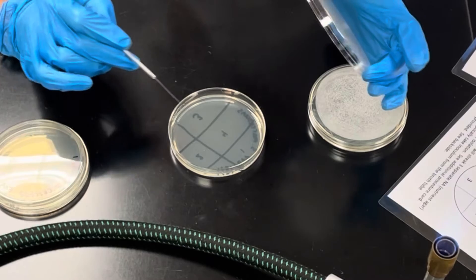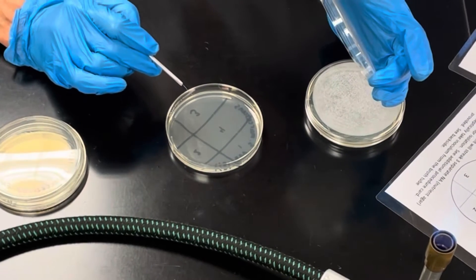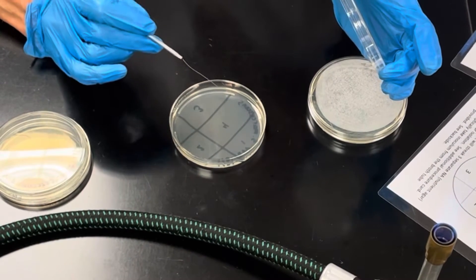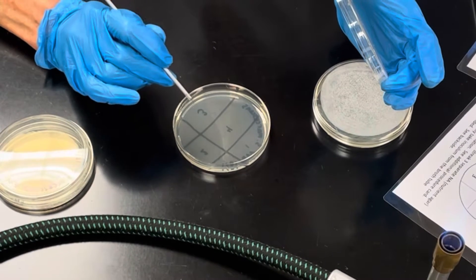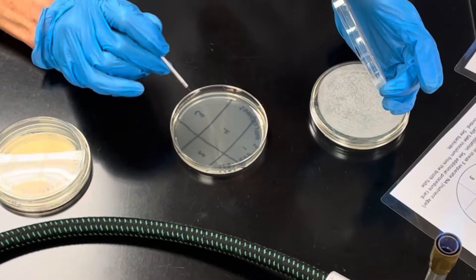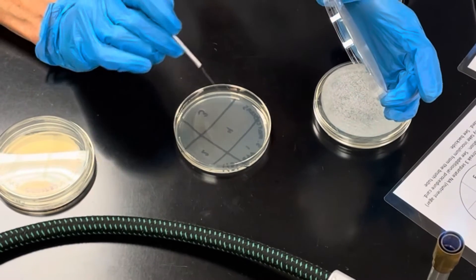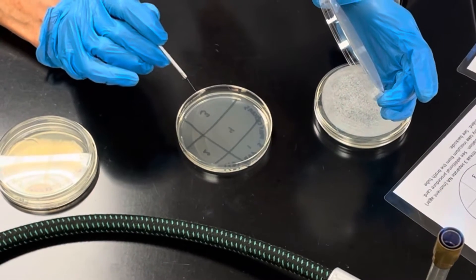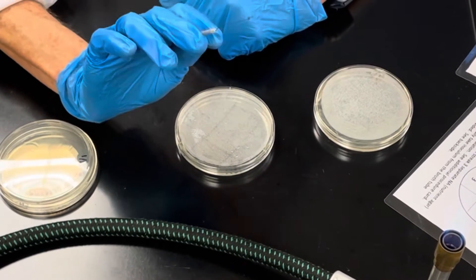Take that bacteria and streak it across quadrant one by making a Z pattern approximately five times. You want a tight Z pattern — one, two, three, four, five — and your lines should not crisscross each other. Then flame your loop.